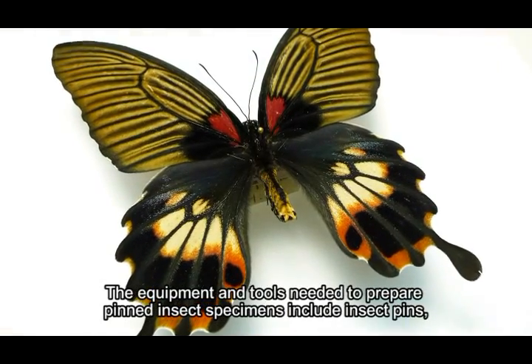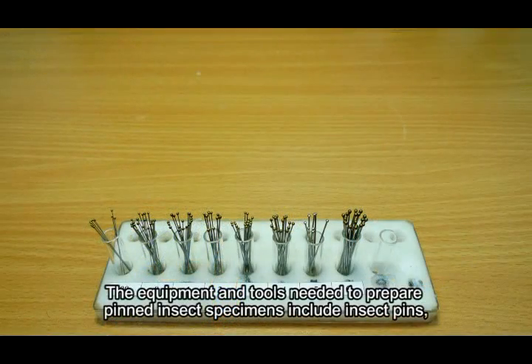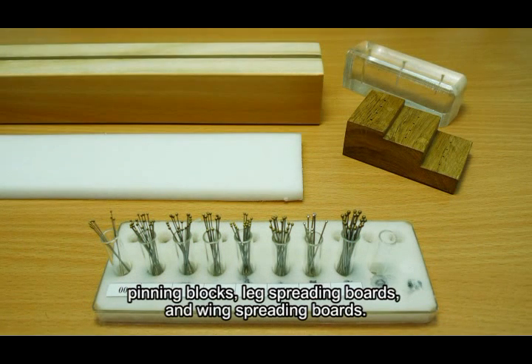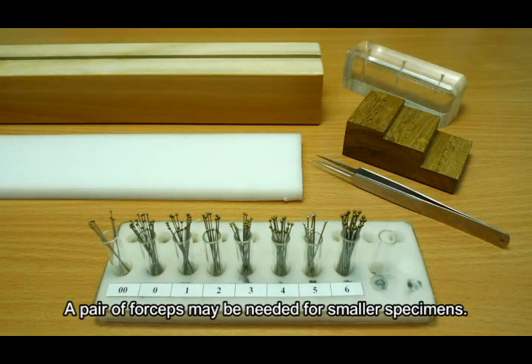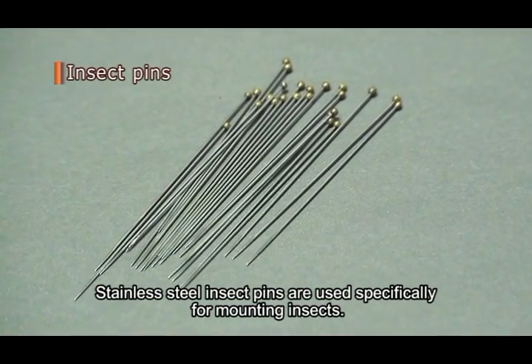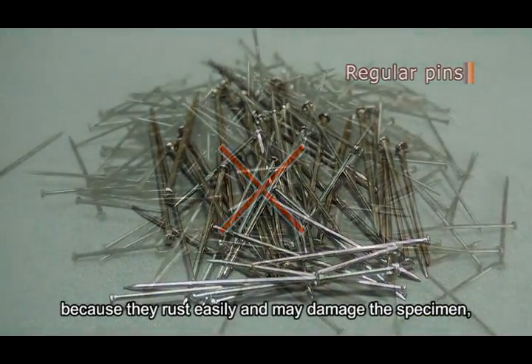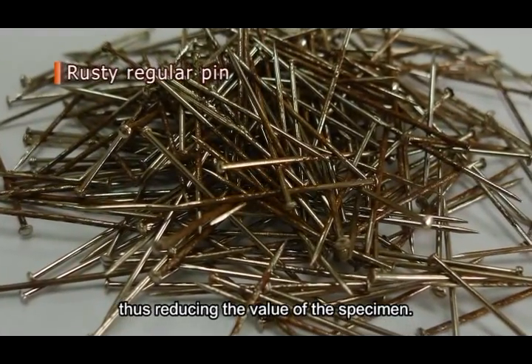The equipment and tools needed to prepare pinned insect specimens include insect pins, pinning blocks, leg spreading boards, and wing spreading boards. A pair of forceps may be needed for smaller specimens. Stainless steel insect pins are used specifically for mounting insects. Regular pins are undesirable because they rust easily and may damage the specimen, thus reducing its value.